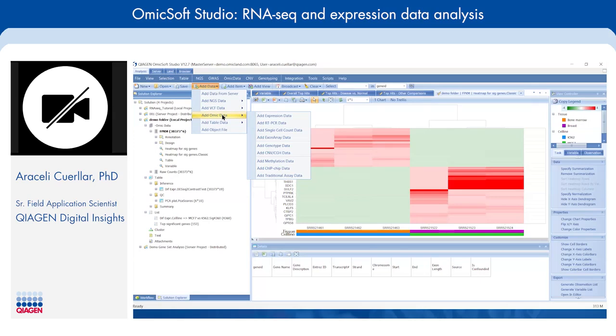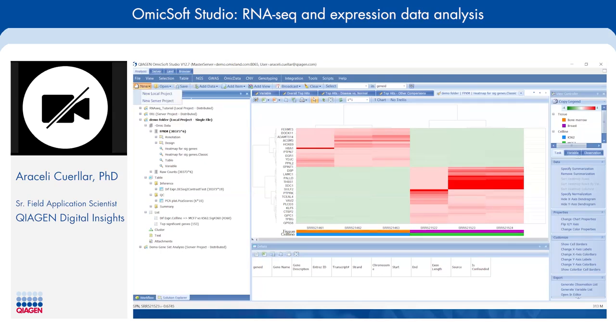That's something that I can definitely share with the product manager to let them know that there is interest in that. I do know that in the future, we will start including a lot more proteomics data, including Olink generated data in our lands. So I imagine that the same analysis tools that were used for those lands data, maybe we could make accessible to you guys through our analysis tab. But thank you so much for that feedback, and I will certainly let the product manager know that there is interest in that. Well, that's great to know. Yeah, pretty cool. Olink is super cool because you can look at so many different things all at once instead of some of these older protein array kind of things.